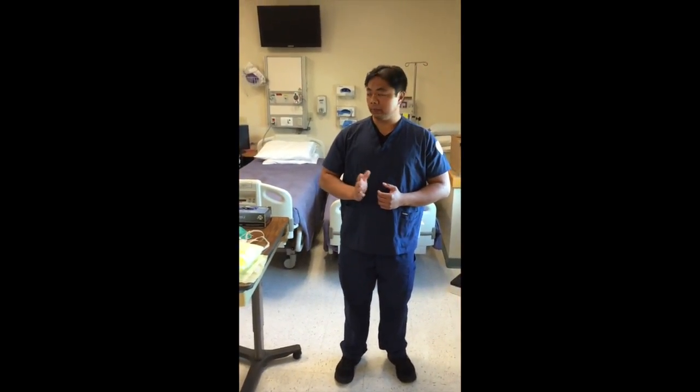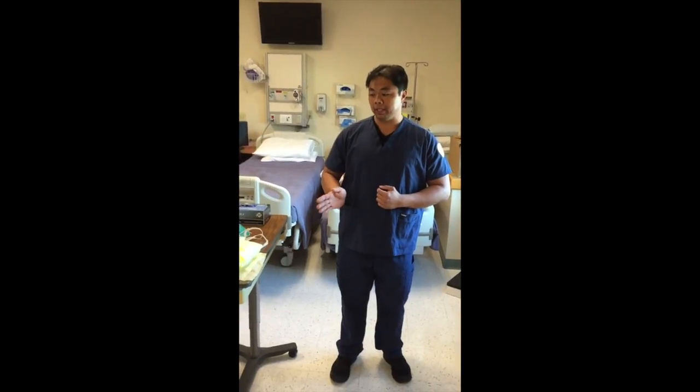This is JT Ramos, and today I'll be demonstrating how to put on your personal protective equipment, or PPEs.